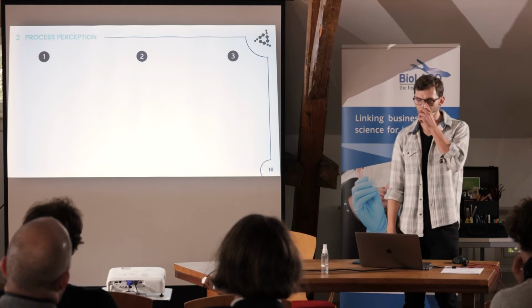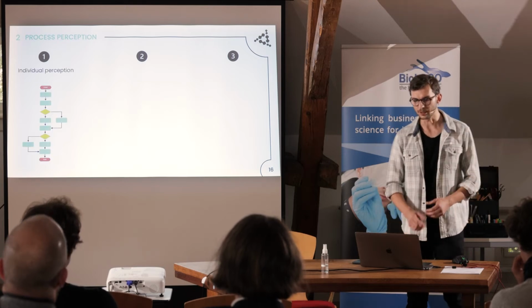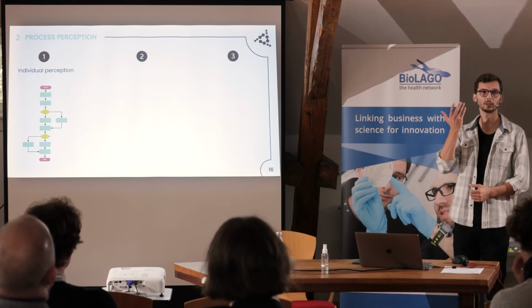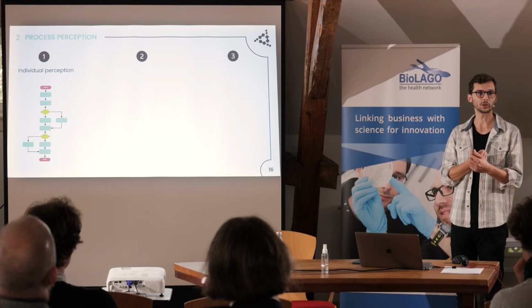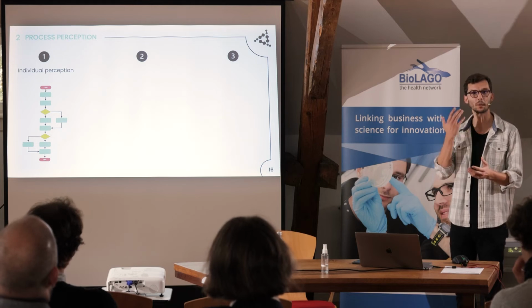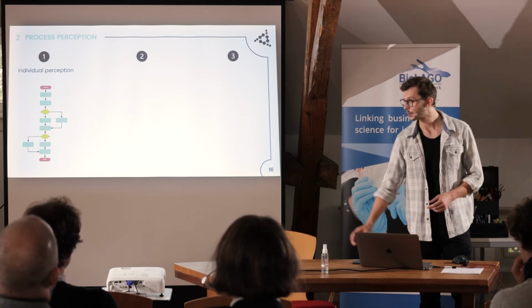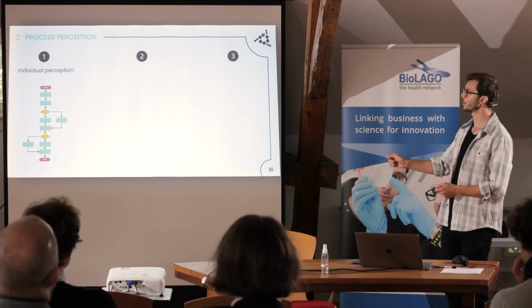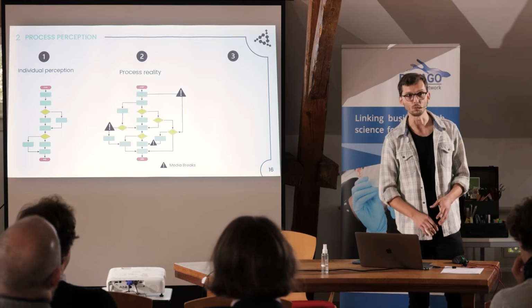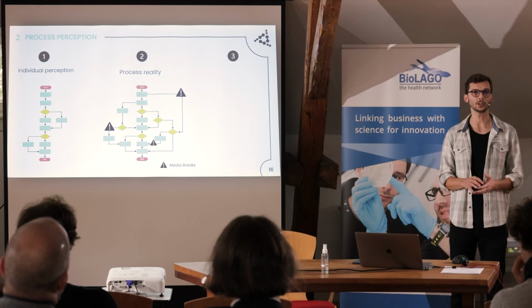To have a better understanding: processes in the laboratory are mostly very individual. It's like a recipe in mind: I'm doing step 1, step 2, step 3, step 4. It all makes sense if I'm playing the steps in my head. But if we put a post-it on a wall for every step and write down what we are doing within this step, it looks more like a network. It's not a flow in one direction.